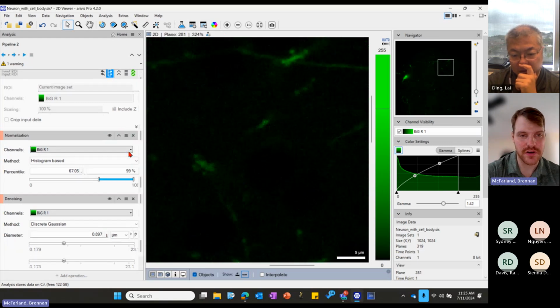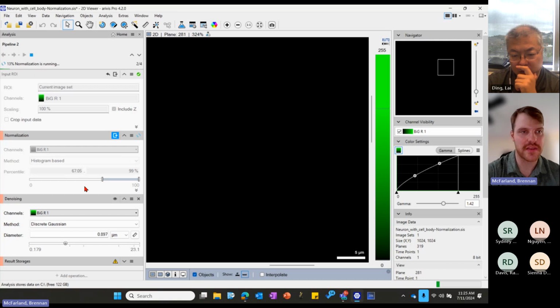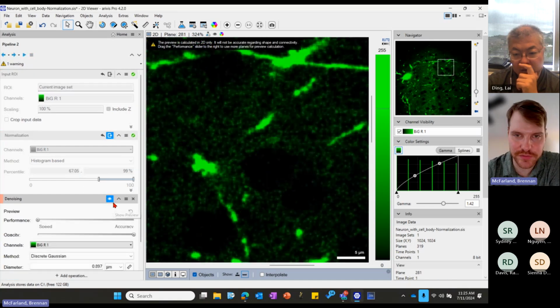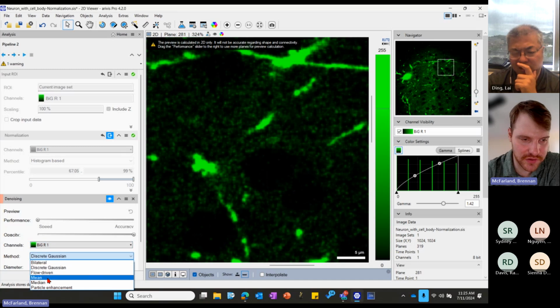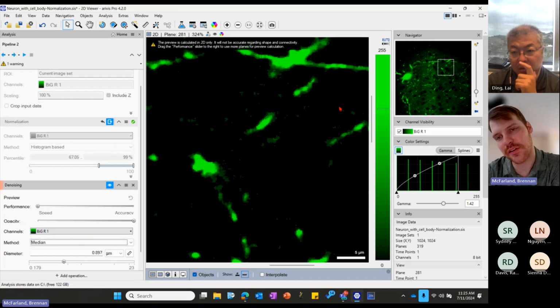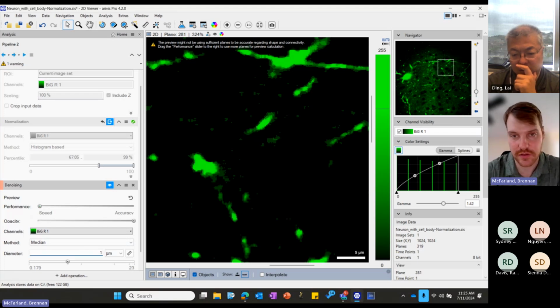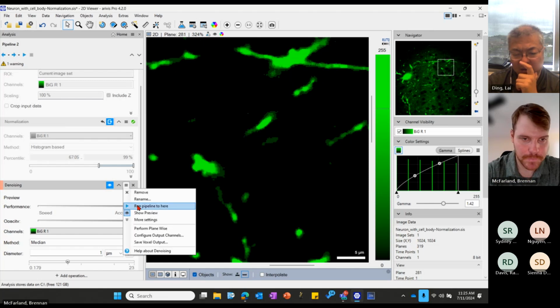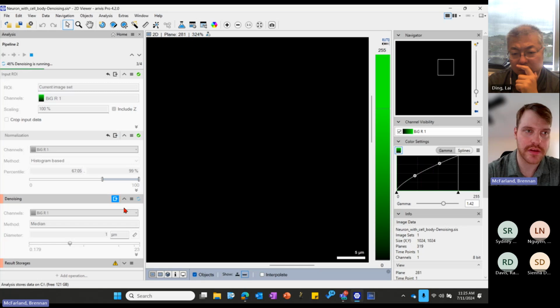You see how long this will take to run. I think this is also going to take a little bit of time. Okay, that's a little faster. And then we can do a Gaussian filter, or no, maybe median's better. I always like median. Yeah, median always works really well for despeckling. So we can do something like this, raise the kernel size to be a little bit bigger, then enter. That shouldn't take long to run either.